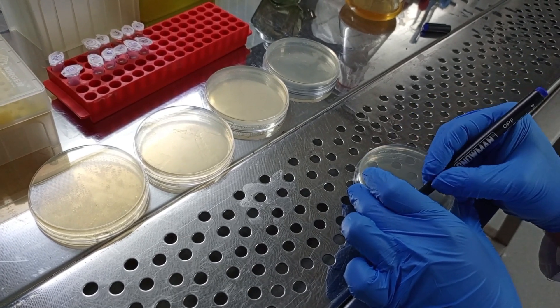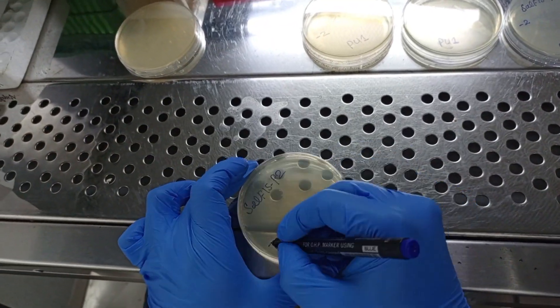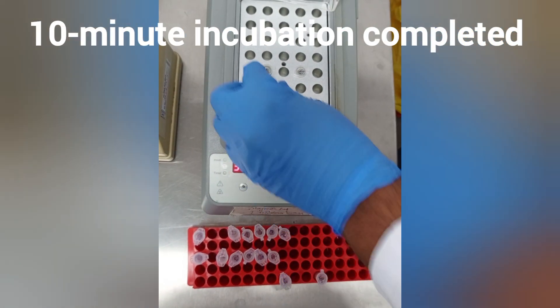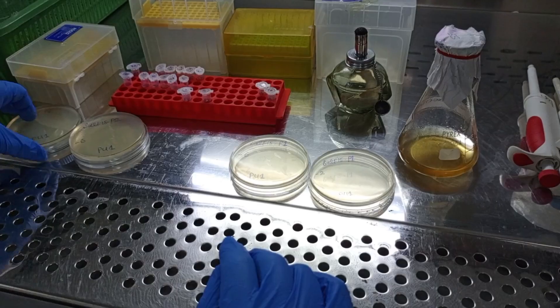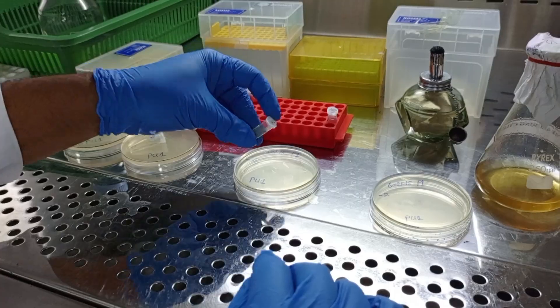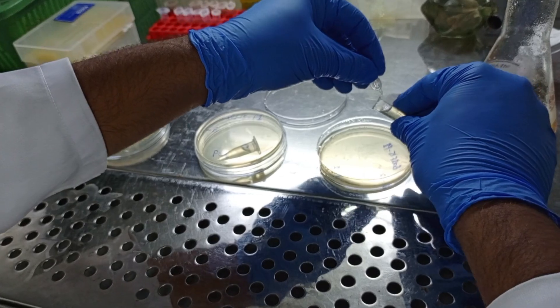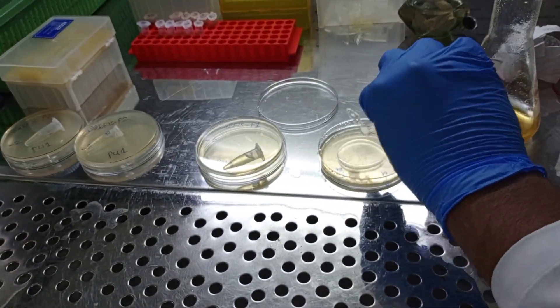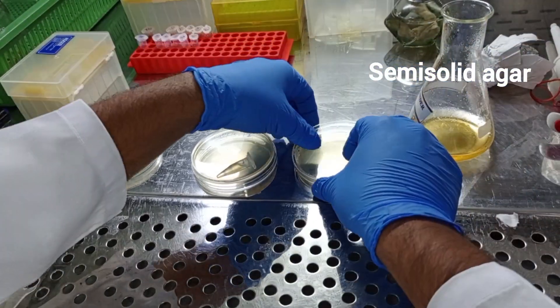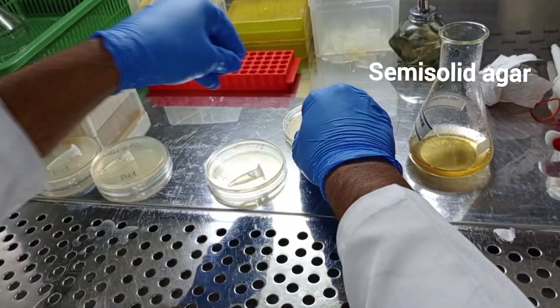Meanwhile, take LB plates according to the number of dilutions you are going to use and label them accurately. Here we go to the incubator to retrieve the dilutions of the purified phage suspension. Put them over the labeled plates to avoid any cross-contamination or mislabeling. Pour all the dilutions onto separate LB agar plates and spread with the help of 4 ml of poured semi-solid agar by rotating the plate 8 to 10 times.